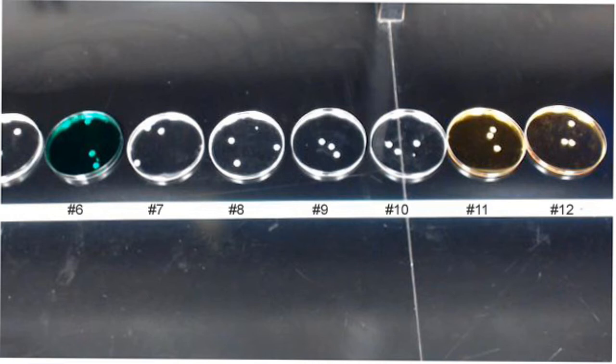Now, as described in lab module 15, we are going to evaluate the effectiveness of each of these 12 chemical antimicrobials against 2 different types of bacteria. One of them is a gram-negative rod, the other one is a gram-positive coccus. The gram-negative rod is E. coli, and the gram-positive coccus is Staphylococcus aureus. Now, previous to starting the video, I had set up 3 different plates for E. coli and 3 different plates for Staph aureus.